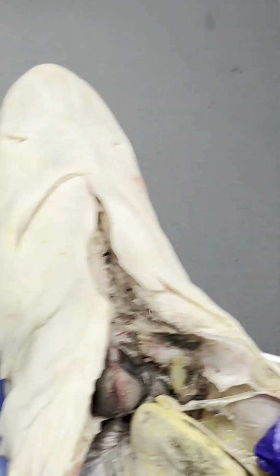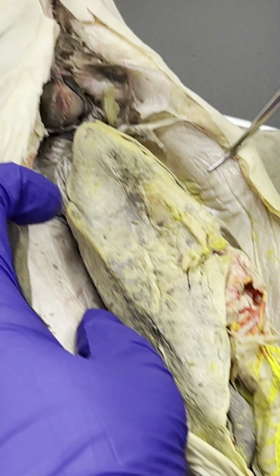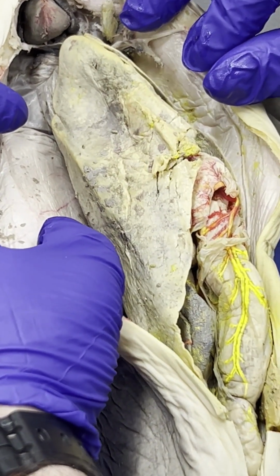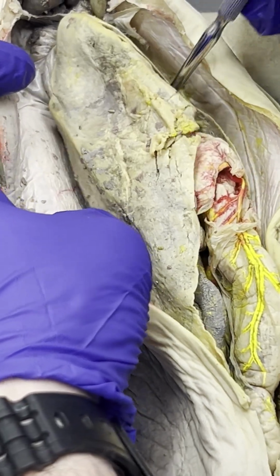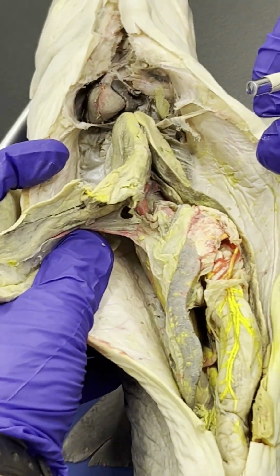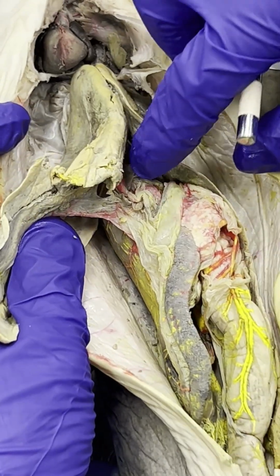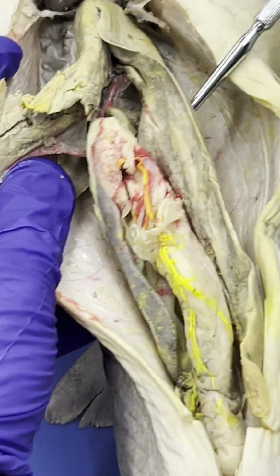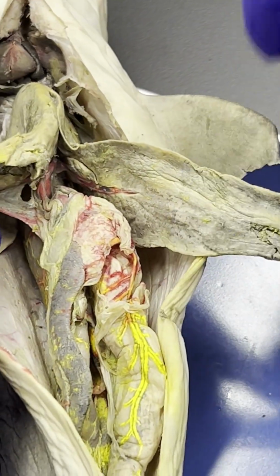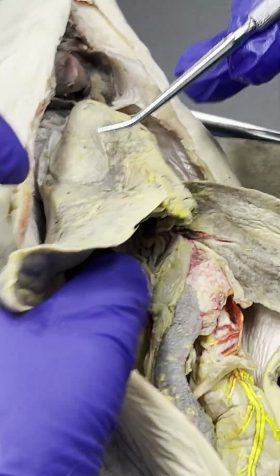Let's just jump right into the digestive system, which is my favorite organ system in this entire class. So, the shark has one liver, but three lobes. We have the right lobe of the liver. These livers are pretty long for this animal. So the right lobe would be this entire thing, right side of the animal. Then we have the left lobe of the liver, which is right here. And then we also have the median lobe of the liver, which is going to be attached to the right lobe of the liver.